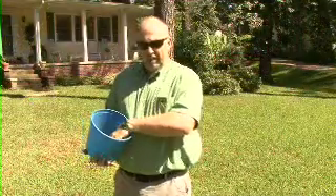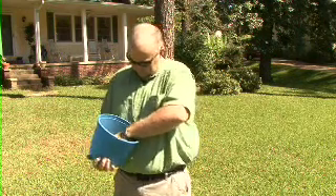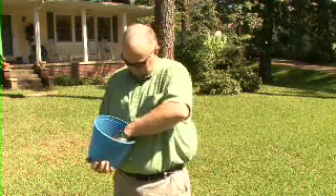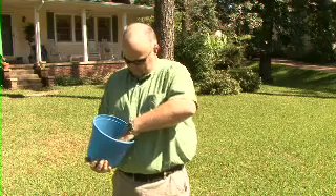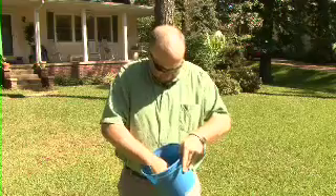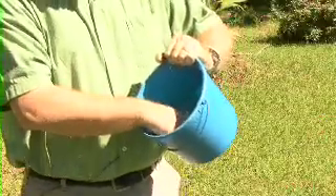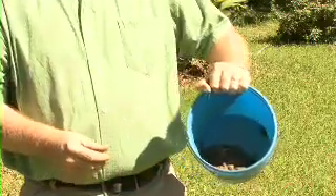After you get all the grass out of the sample, you want to take the cores and crush them. Once you get the sample mixed up, it looks something similar to this.